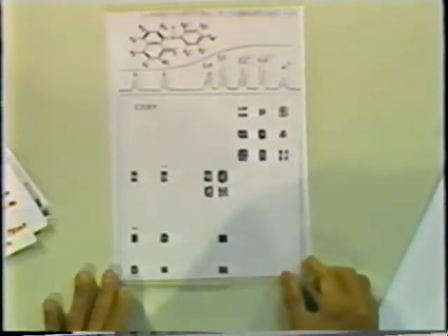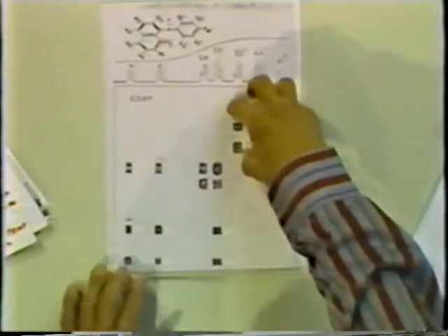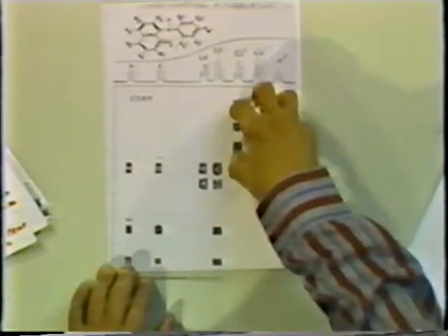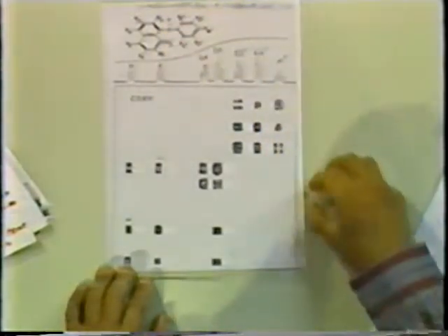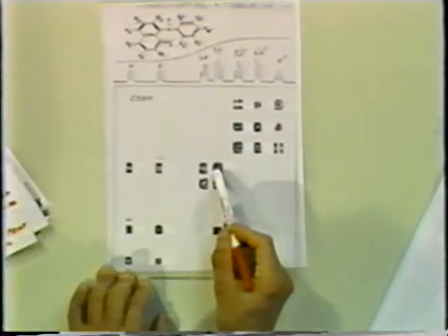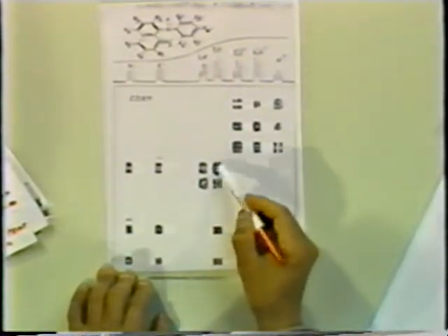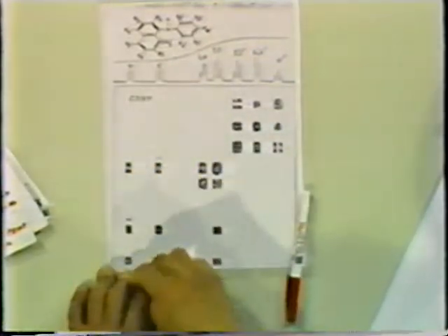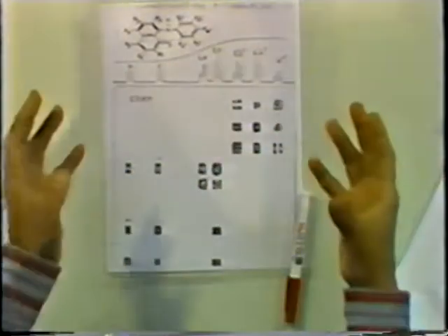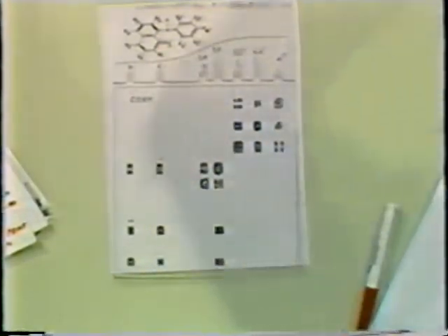But you run a simple COSY on that, and you get the answer in a pictorial form, which says there is one system here, not coupled to another, and all these transitions belong to this ring. There is a peak here, which is coupled to this one, but not to anything else. So there is one ring system here, and there is another one which is here. So the three ring systems are separated out in a very illustrative way by a simple application of COSY.